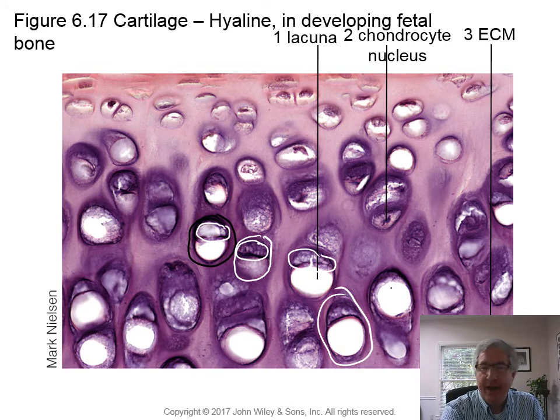And then outside that, this is all the extracellular matrix. Let me go with a completely different color. How about red? There we go. So this is your extracellular matrix here. There's your ECM.